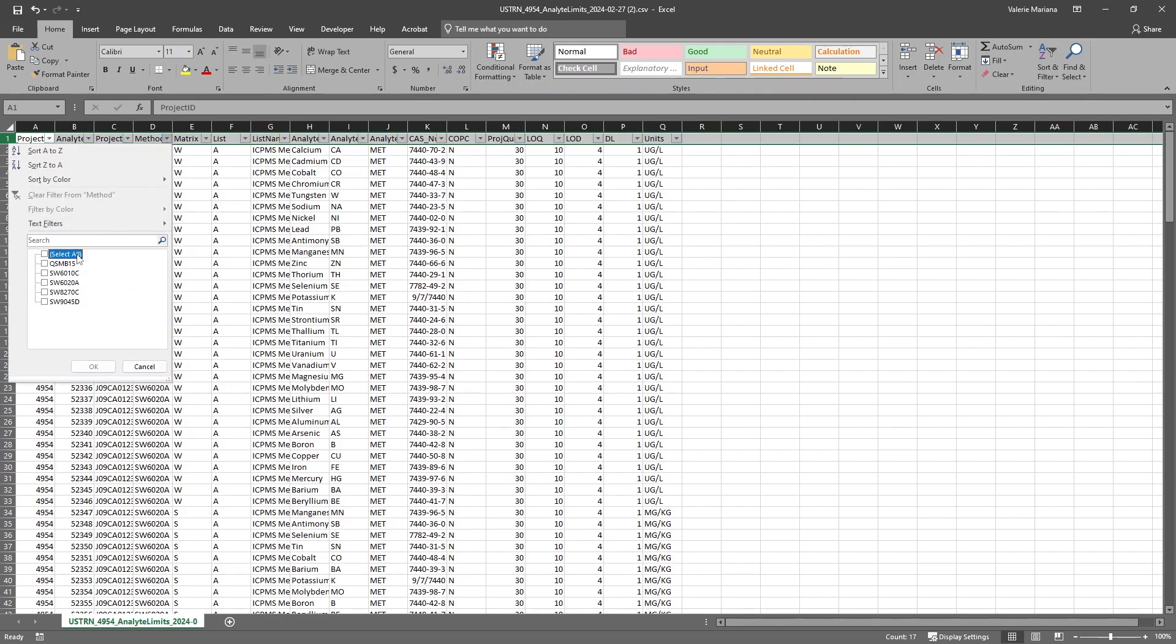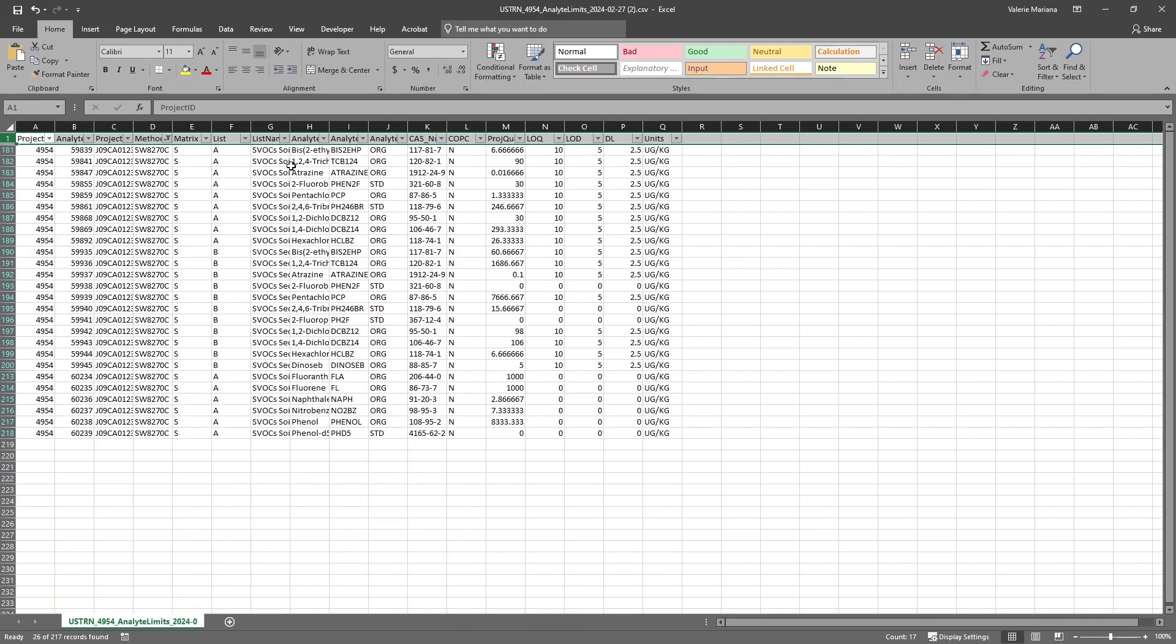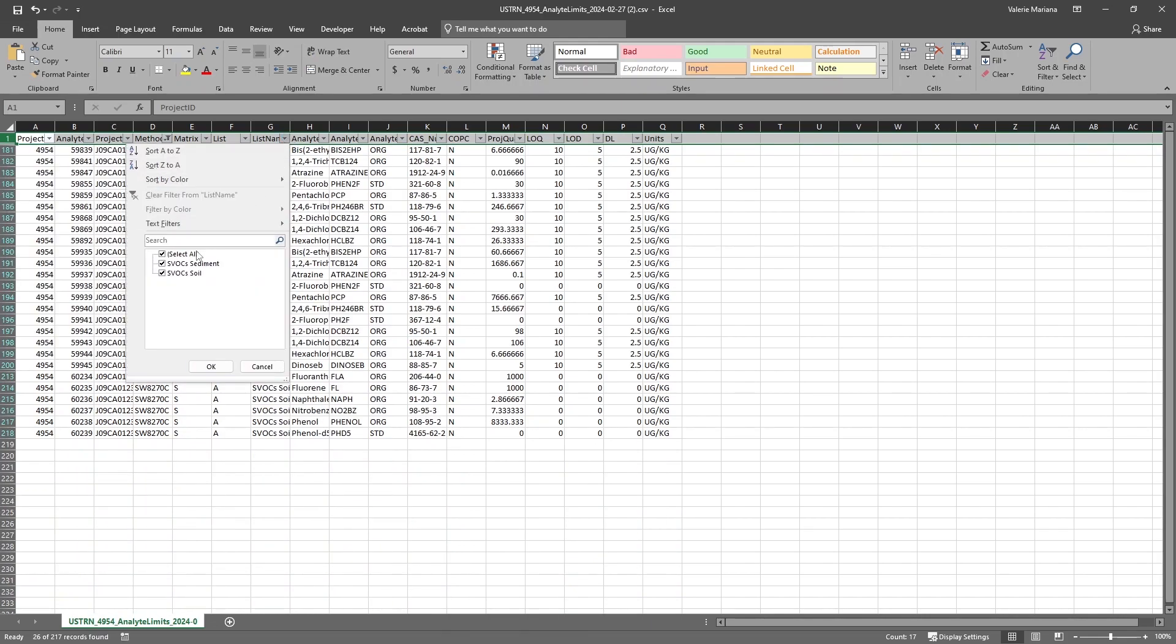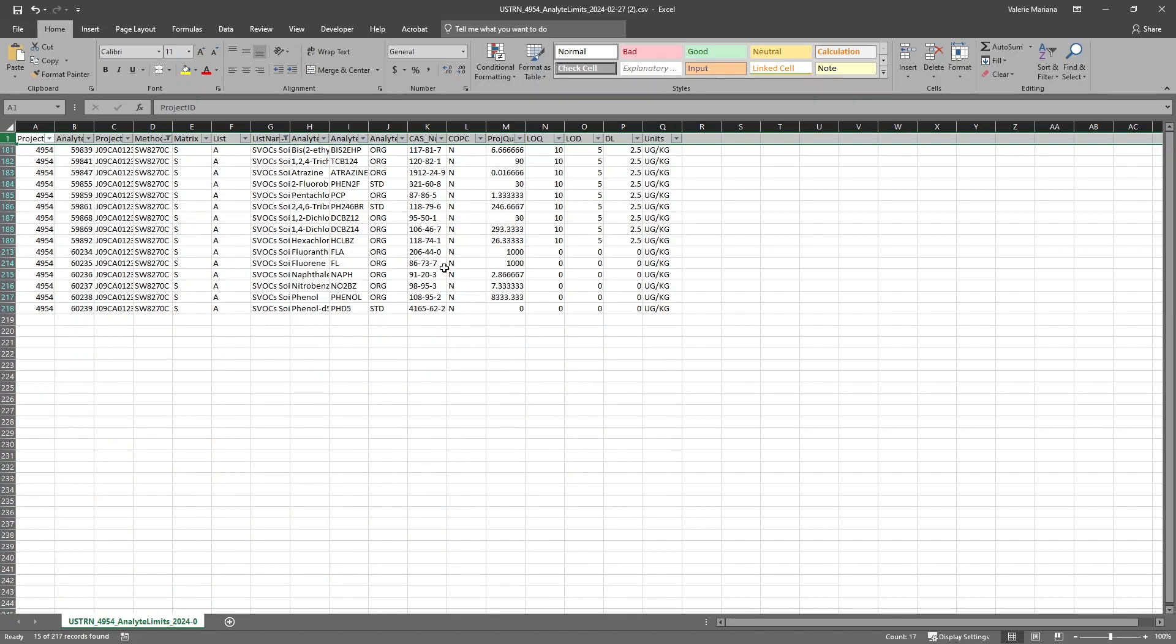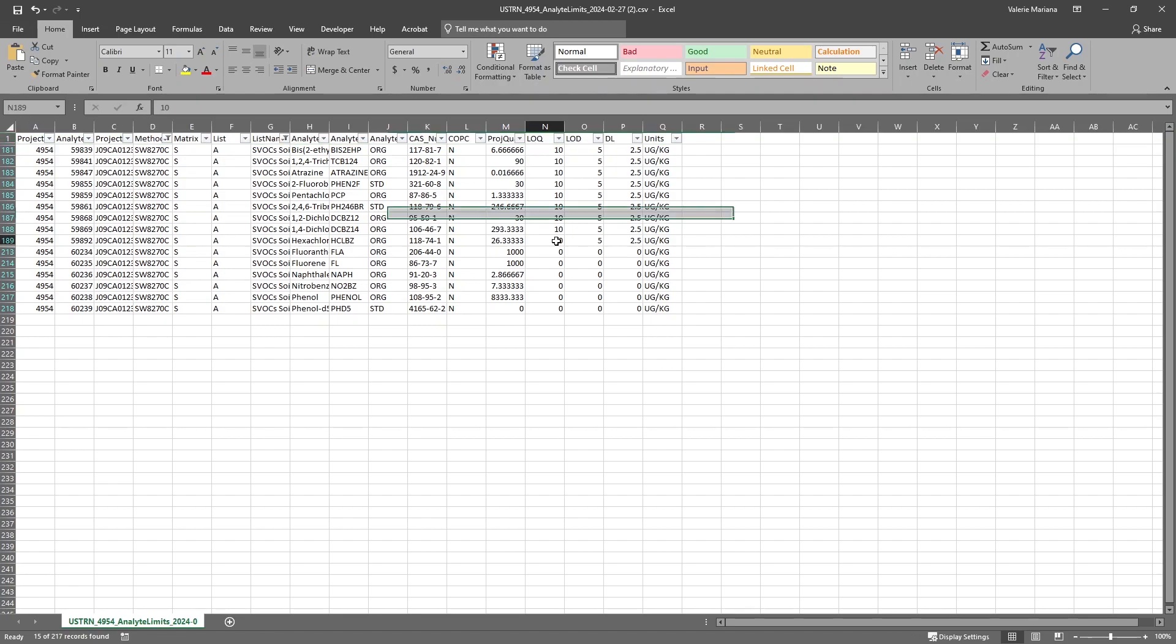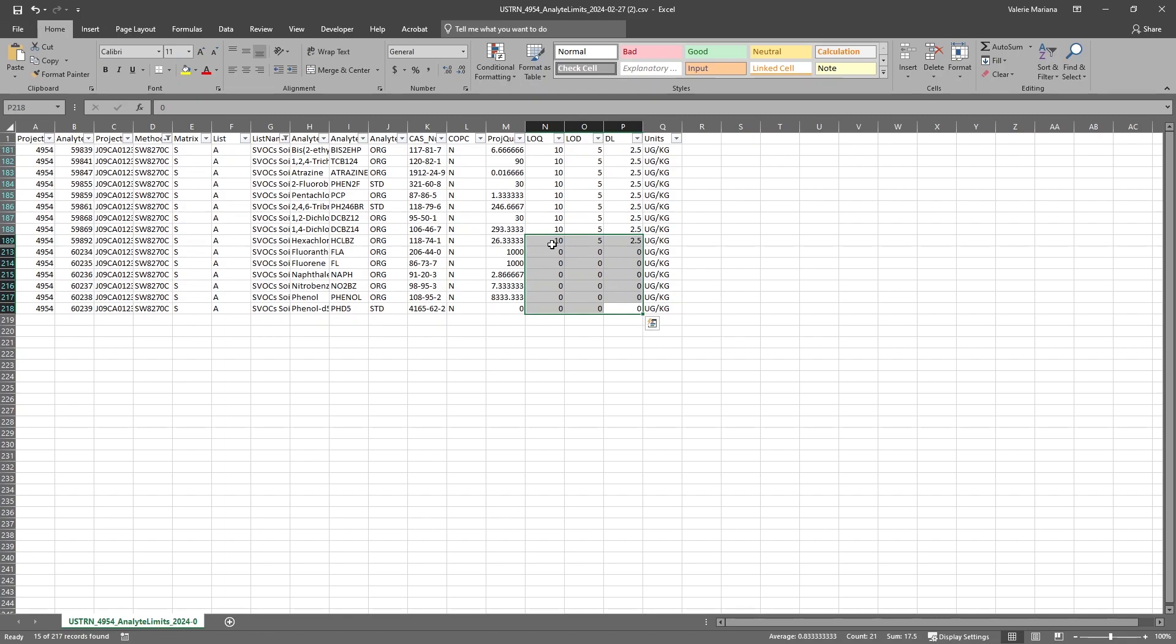Let's filter to find our desired list. In this case, the SW8270C soil list. We can fill in the blank LOQ, LOD, and DL fields with the limits provided by our lab. We will quickly enter some sample data.